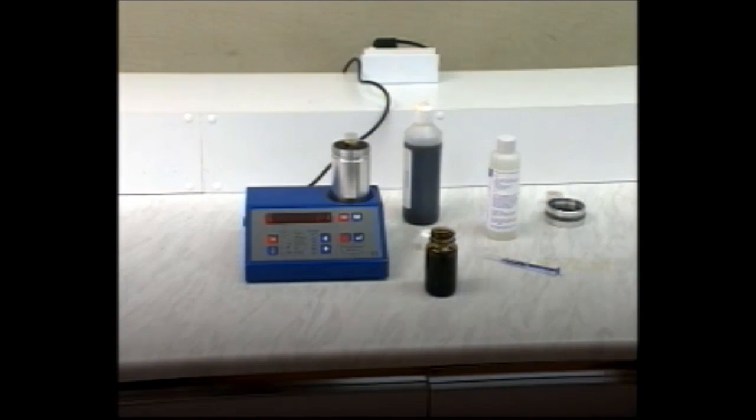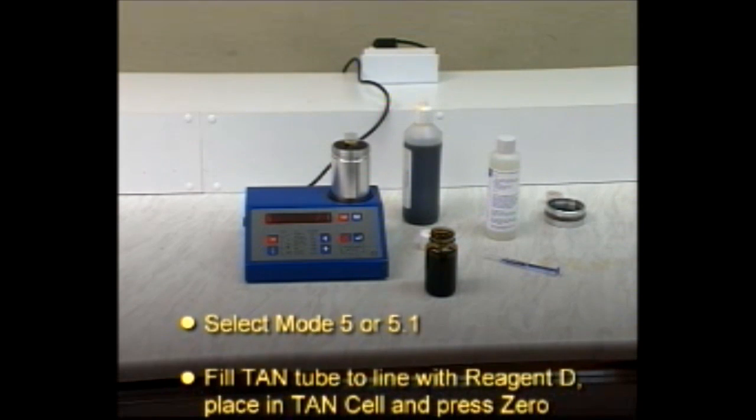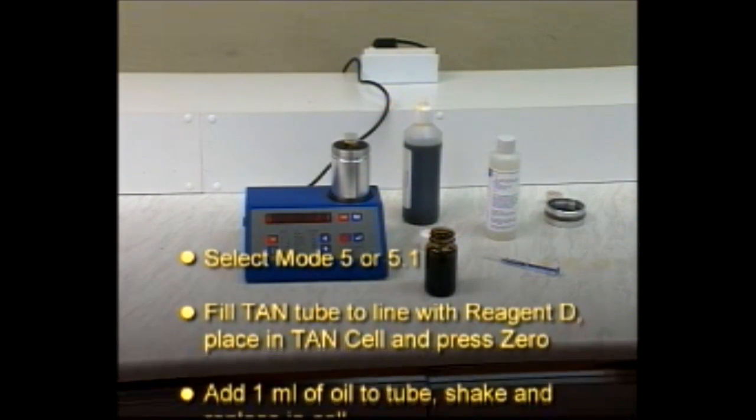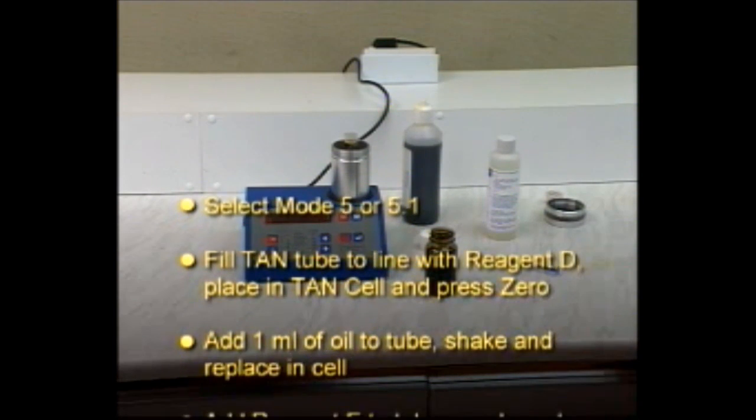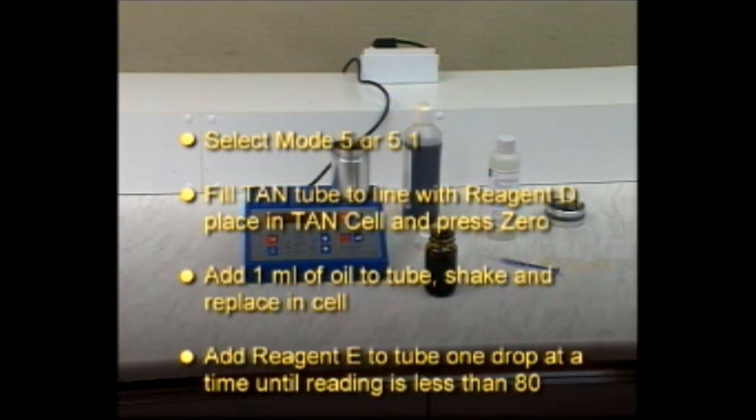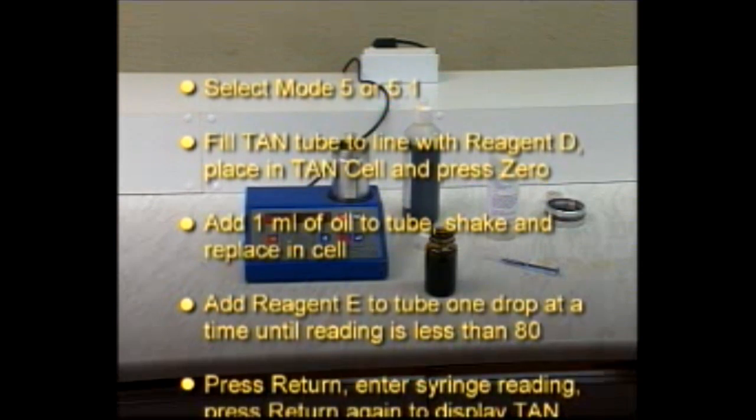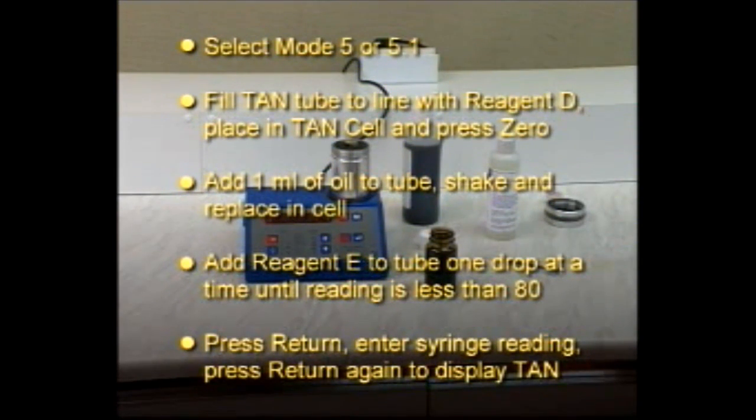To summarize, use mode 5 or 5.1. Fill the TAN tube to the line with reagent D. Place it in the TAN cell and press zero. Add one milliliter of oil to the tube. Shake well and replace it in the cell. Add reagent E to the tube one drop at a time until the reading is less than 80. Press return. Enter the syringe reading and press return again to display the TAN.